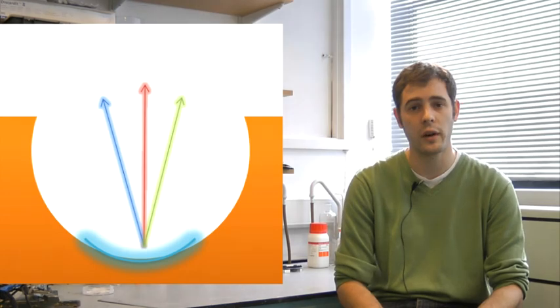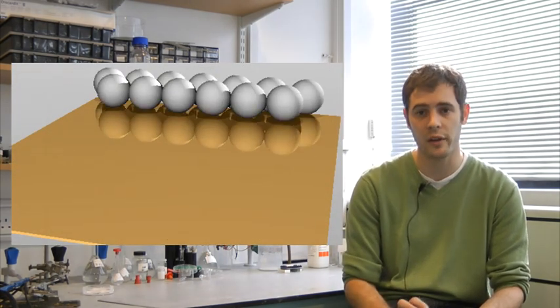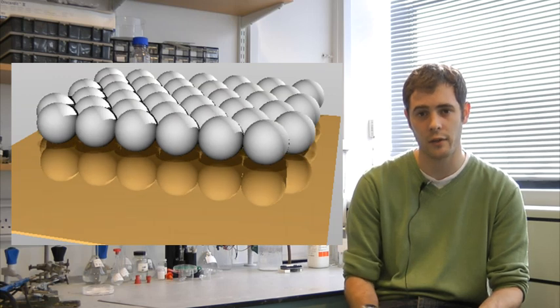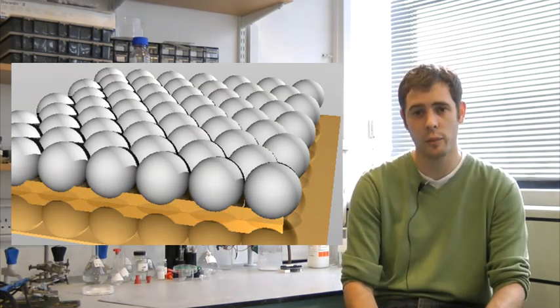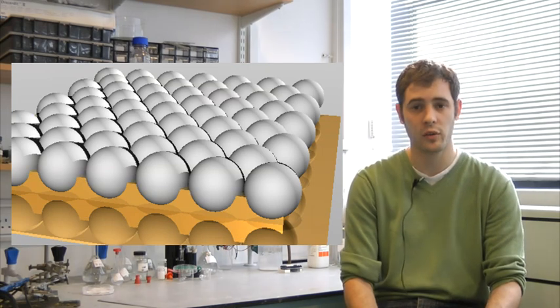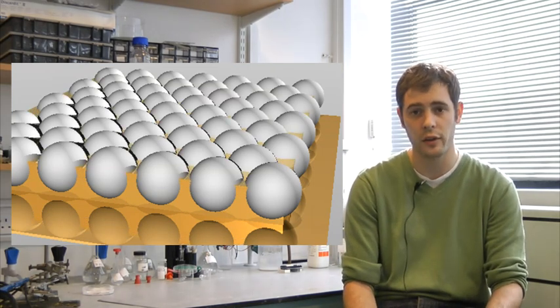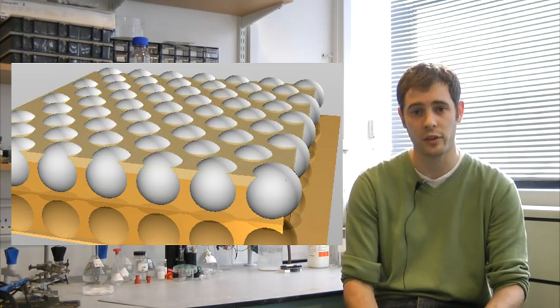My PhD uses something called sphere-segment-void substrates, or SSV for short. We make those by taking a gold slide, and we clean it, and then we place some polystyrene spheres onto it, which line up in a hexagonal array. We then place that in a gold plating solution, and we use electrochemistry to turn gold ions into gold metal, and we plate around the spheres.